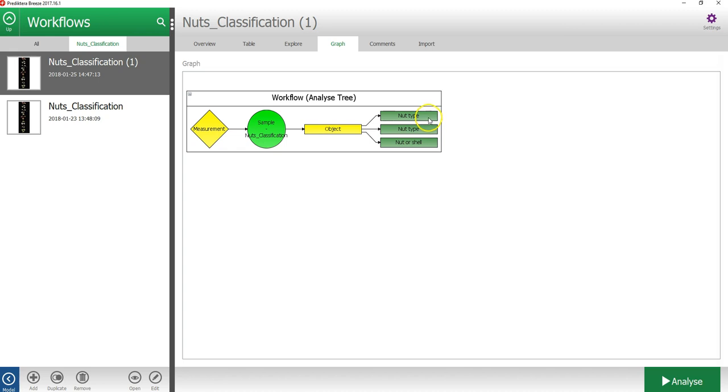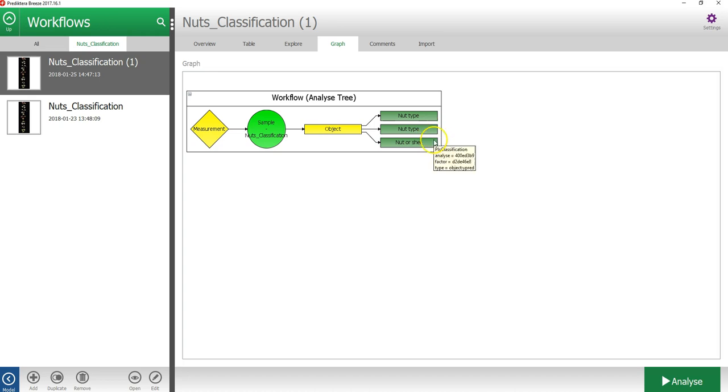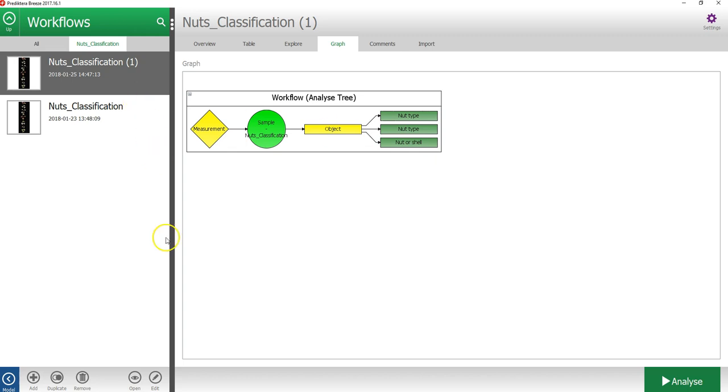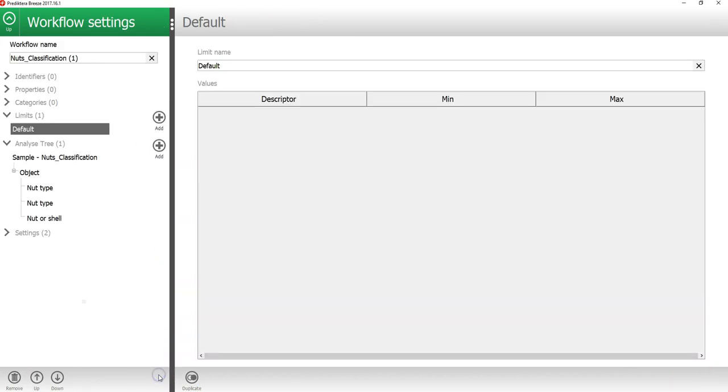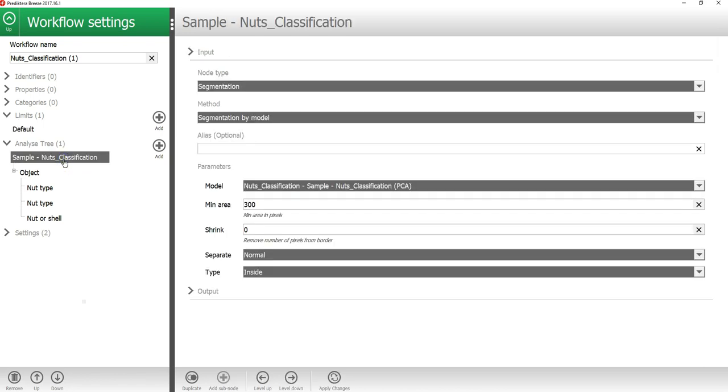If I press the graph tab, I can see that by default Breeze included all the models that I have in the model view into this workflow. This means I have the two nut type models, which was a PLSDA and a Simca, and also I had the existing nut or shell model.